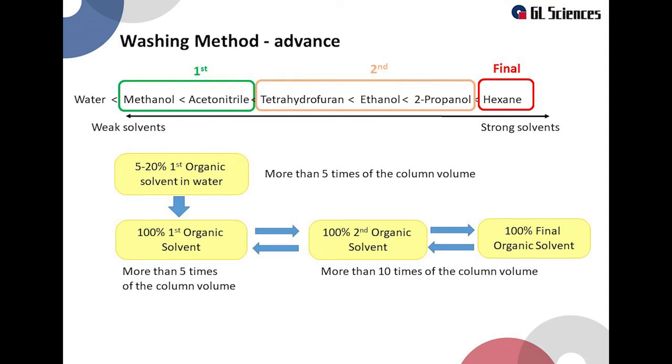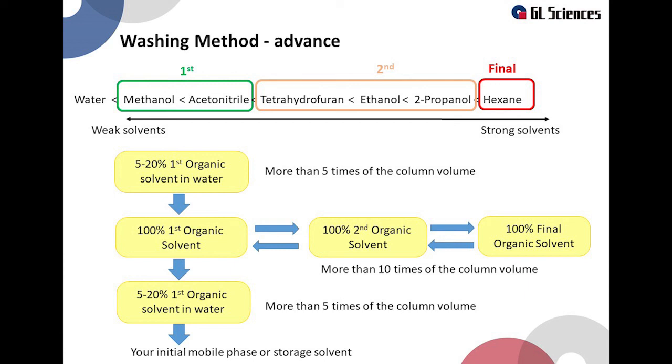The same applies when flowing the hexane from the final choice. After flowing the mixed solution of water and the organic solvent of the first choice and flowing 100% the first choice solvent, flow the second choice solvent. Follow up with using the final choice detergent. Then return to the organic solvent of the second choice solvent and the first choice solvent. Please note that hexane only mixes with the second group solvents. Return to the mixture of organic solvent and water, and let it run at least 5 times of column volume. After that, use the column under the usual analytical conditions and check whether the column has recovered or not.